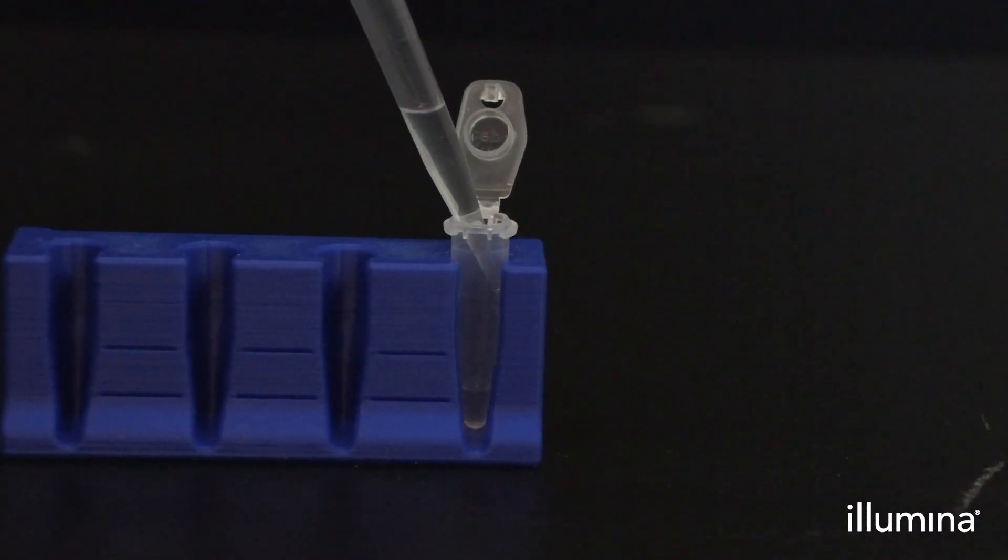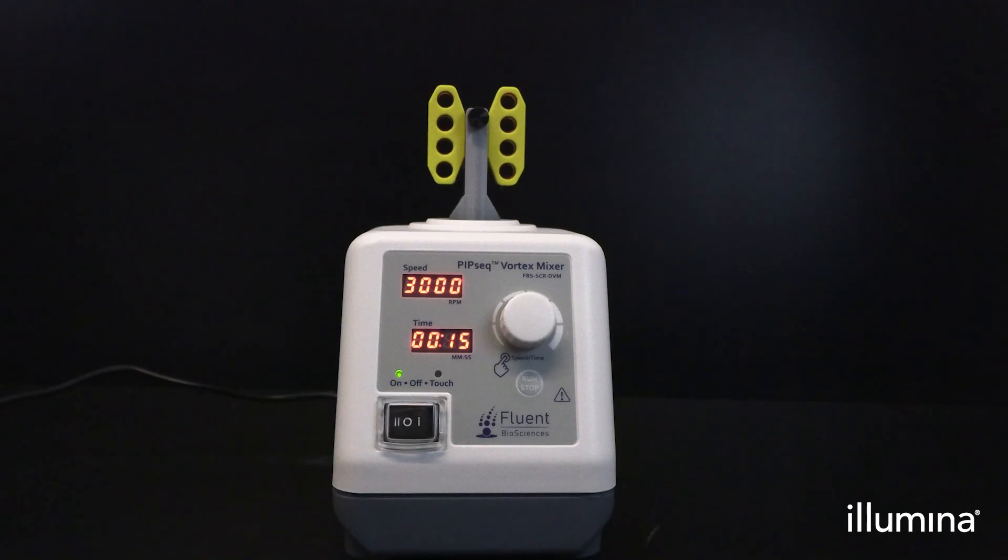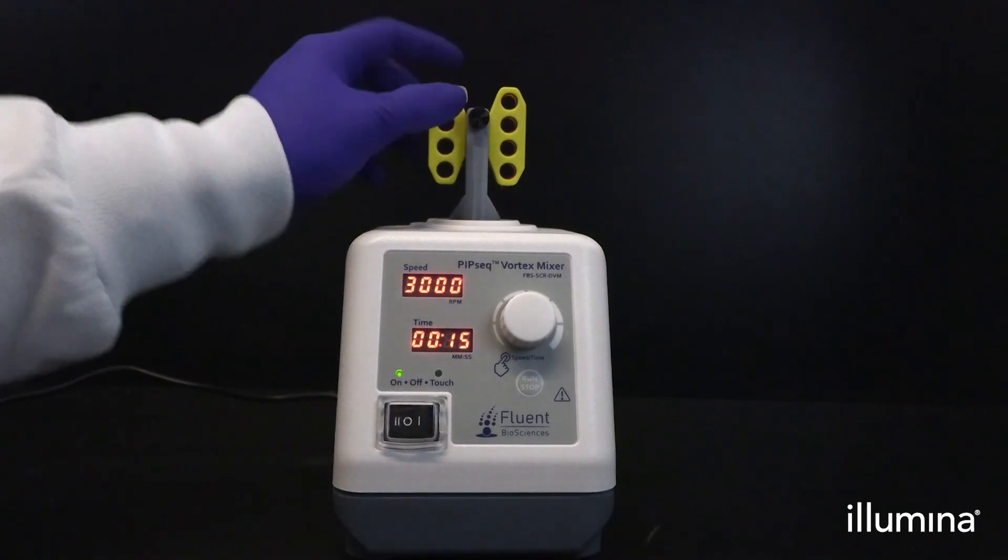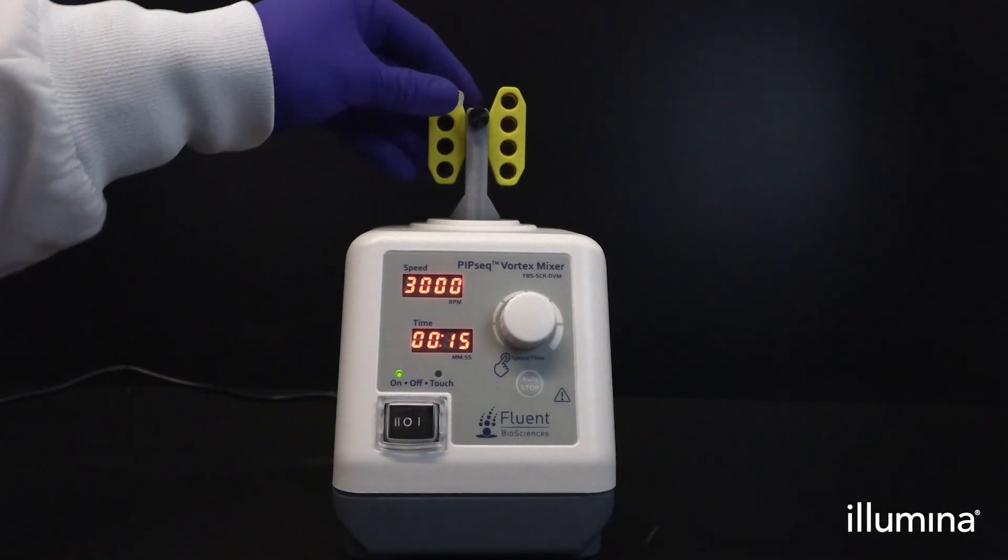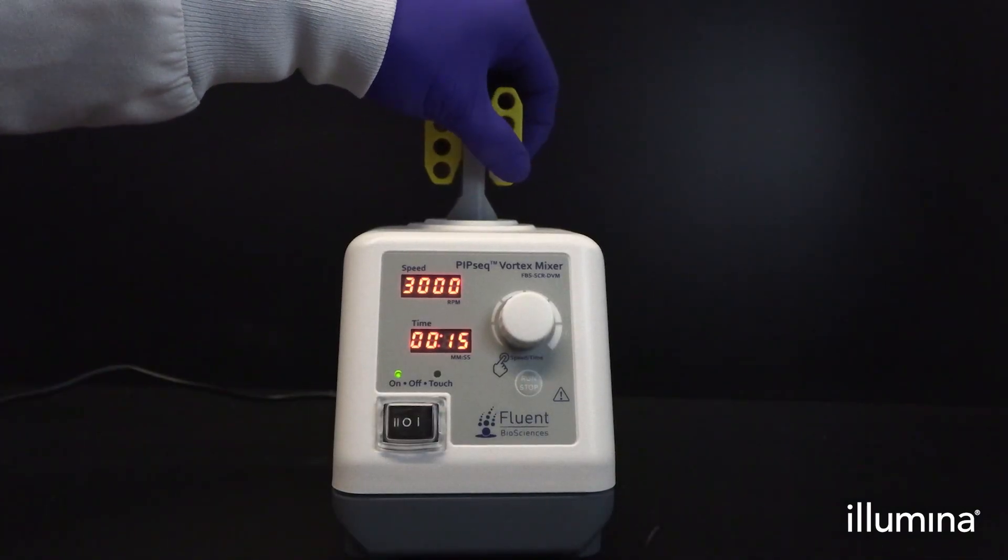Next, add 280 microliters of partitioning reagent down the sidewall of the pip tube. Tightly cap tubes and place in the rotating vortex adapter in the horizontal configuration. Ensure the tubes are fully inserted into the adapter.